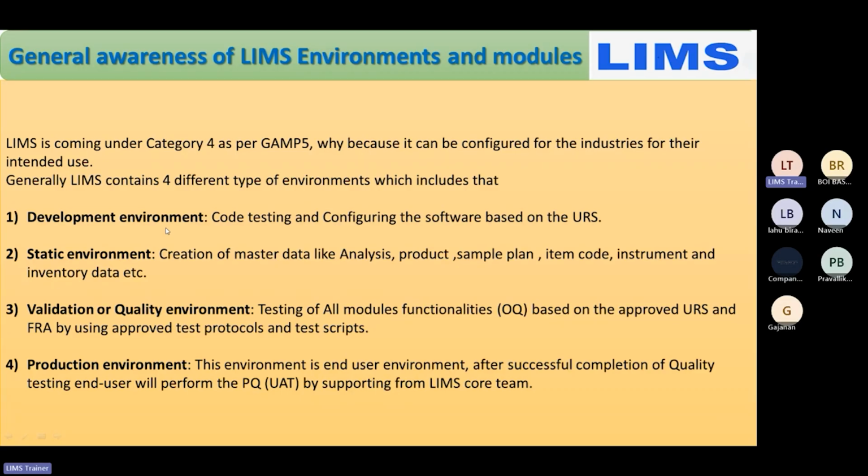And after validation, there will be the production environment. Production environment means the day-to-day operation of the laboratory. If validation is okay, then only the software will be handed over to the production environment. There the user acceptance testing will happen. The end user will test different samples and different testing procedures, and if it is okay, then only the software will go live in that particular laboratory.